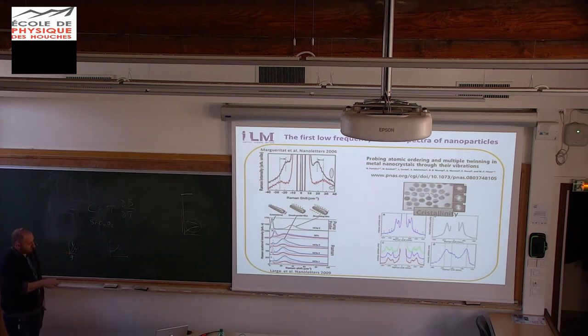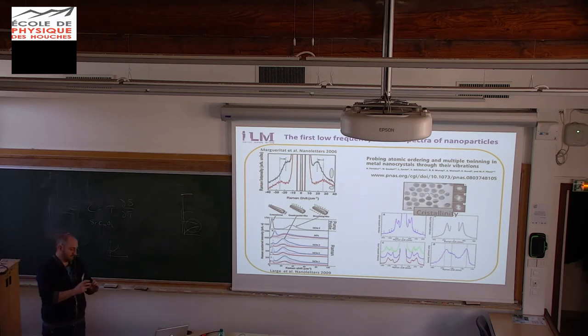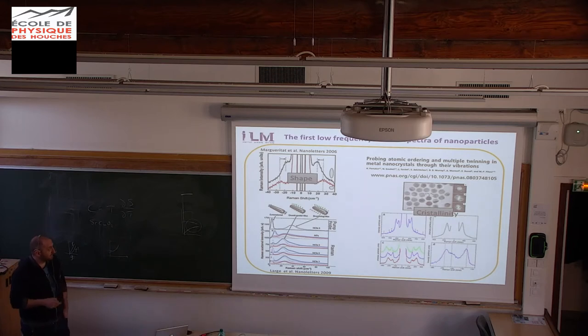And here I just show you a comparison. So this is Raman. This is pump-probe spectroscopy. So I just want to show you that the information is almost the same, but we do not access exactly the same type of vibration mode. So they also see this extensional vibration mode like us, but in their case, they observe the breathing mode of the diameters. In the case of Raman, we also see this mode, but it's more difficult to extract from the spectra. But this is just to tell us these two techniques are really complementary and we can do really a lot of things with that. So we have access also to the shape.